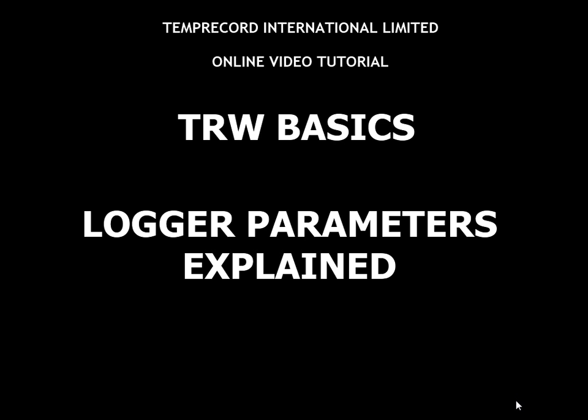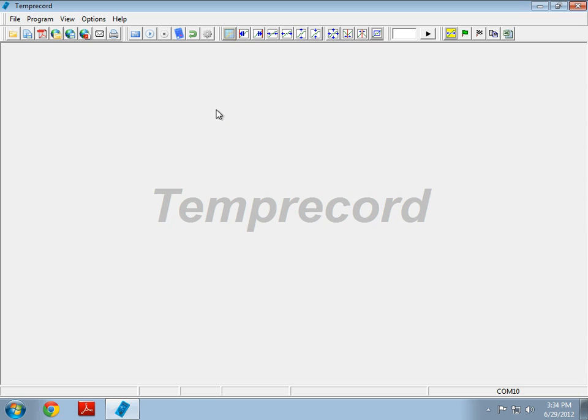In this tutorial we will cover logger parameters in more detail using Temprecord for Windows software. My name is Luca Bartolets and I'm the Research and Development Engineer at Temprecord International Limited. So here we have Temprecord for Windows opened up and I will just go to Program Parameters.